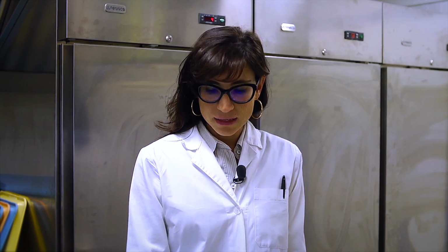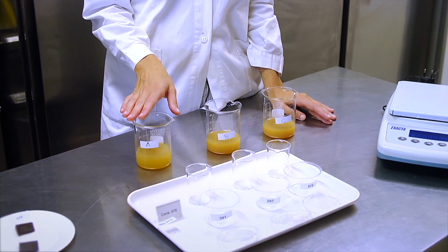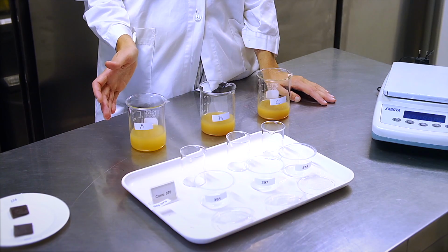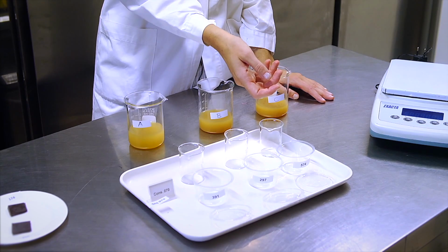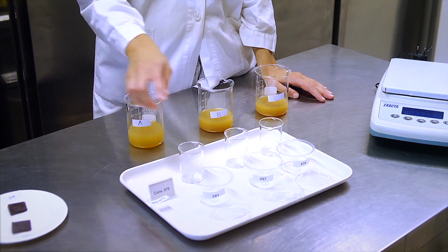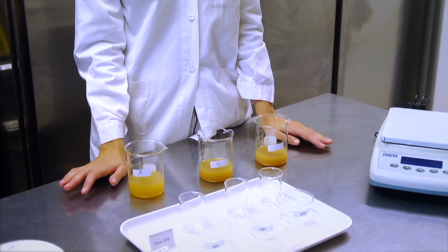Let's make an example. We have mentioned a triangle test on juices. How to prepare a triangle test? We need 3 different samples of juices, for example, commercial brands, but as usual in sensory analysis, we do not identify samples with brand, but instead with 3-digit random codes. The fact that codes are anonymous serves in order not to create bias, not to create expectation in assessors.